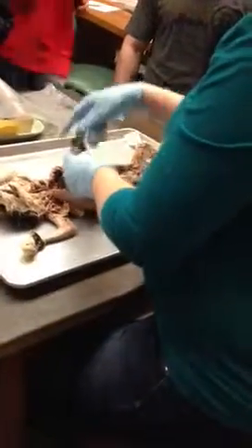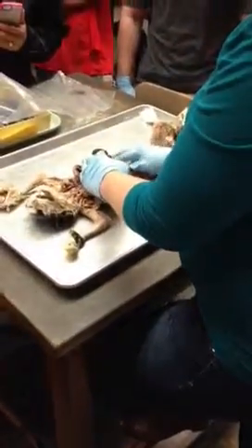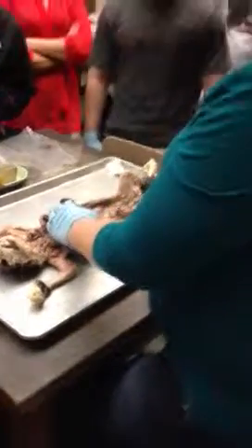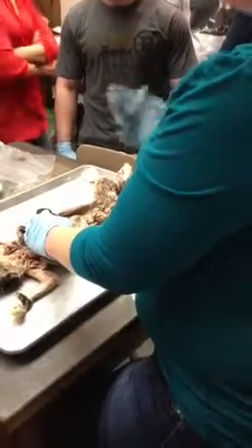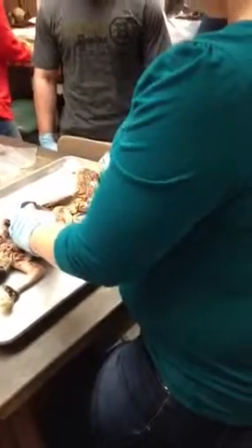Finding the pancreas, okay, you're going to flip the greater omentum back, look at your spleen, and go towards your stomach, and you can see this granular structure that runs here, okay? Kind of looks like squished packing peanuts, okay? That is the pancreas. So the less defined border running between is the pancreas, and that is your spleen.